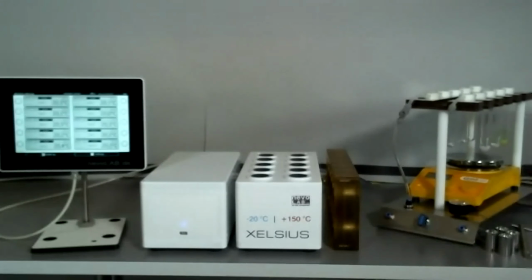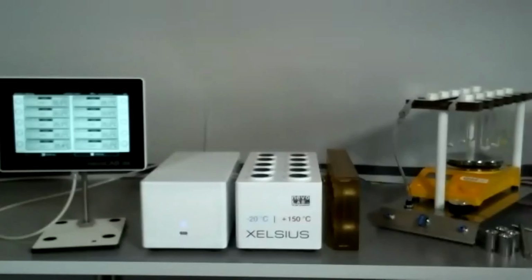Okay, so then thanks Manfred and hello everyone. And I will start sharing the video. This button, okay. So, the XELSIUS device. As you can see here now, we have a standard XELSIUS device.